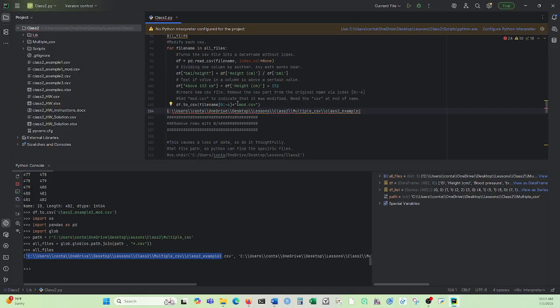Essentially, and then we're going to be adding on... Let me do this more clearly. So we're getting this file name. We're getting from 0 to -4, so negative index. Since it's -4, that means we remove the last 4. 1, 2, 3, 4.